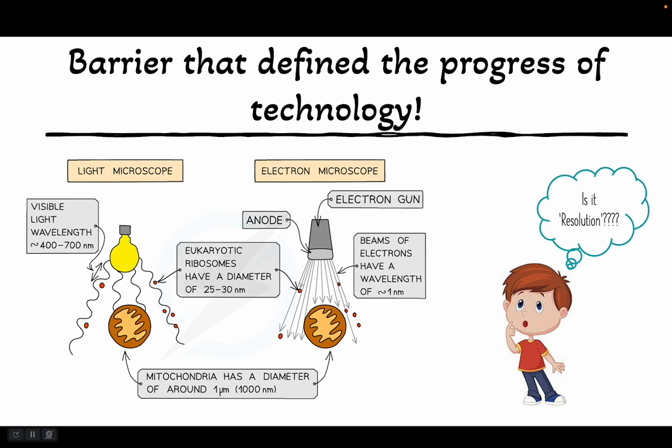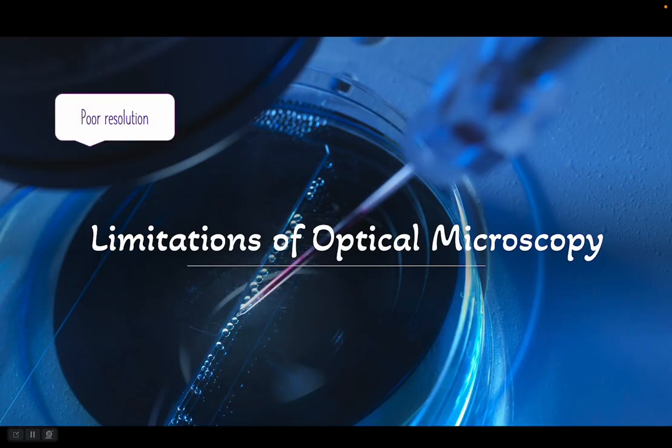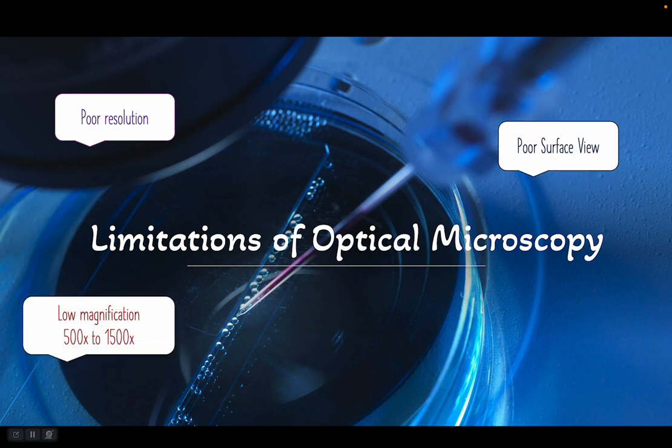This concept of resolution is why we cannot observe the phospholipid bilayer structure of a cell membrane using a light microscope, but interestingly we can do so using an electron microscope. Resolving power of an electron microscope is much greater than that of the light microscope. The drawbacks of optical microscopy, such as poor resolution, poor surface view, and low magnification, limited their use for various applications.